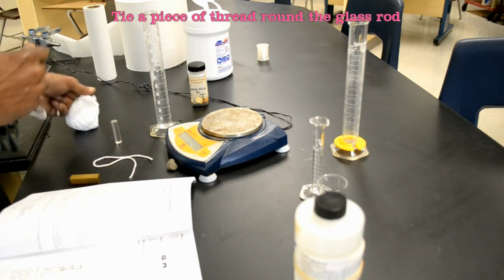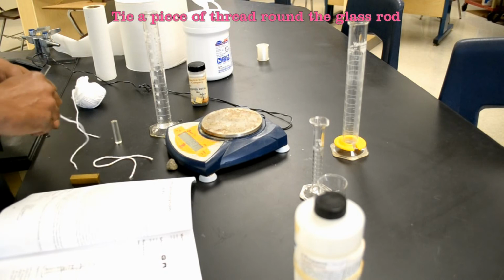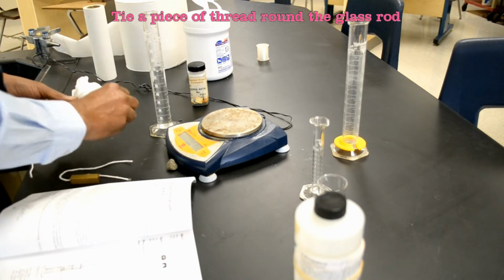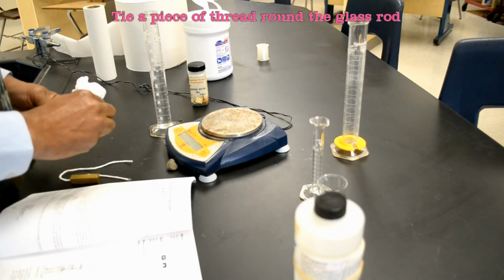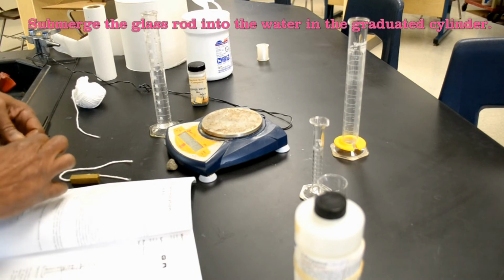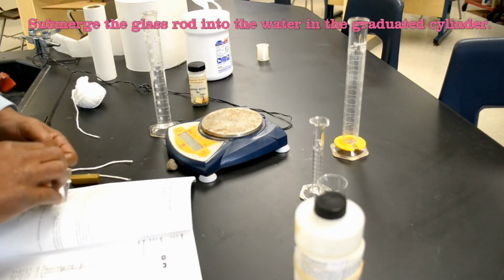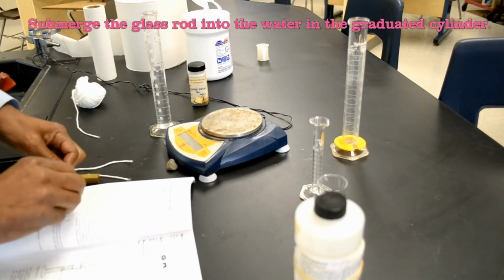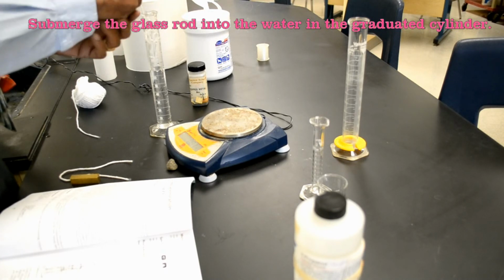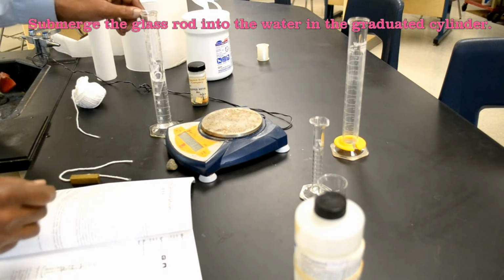Then it says tie a piece of thread around the glass rod as shown. So I'm going to take a piece of string, tie it around the glass rod, and lower the glass into the water in the graduated cylinder until it's completely submerged.